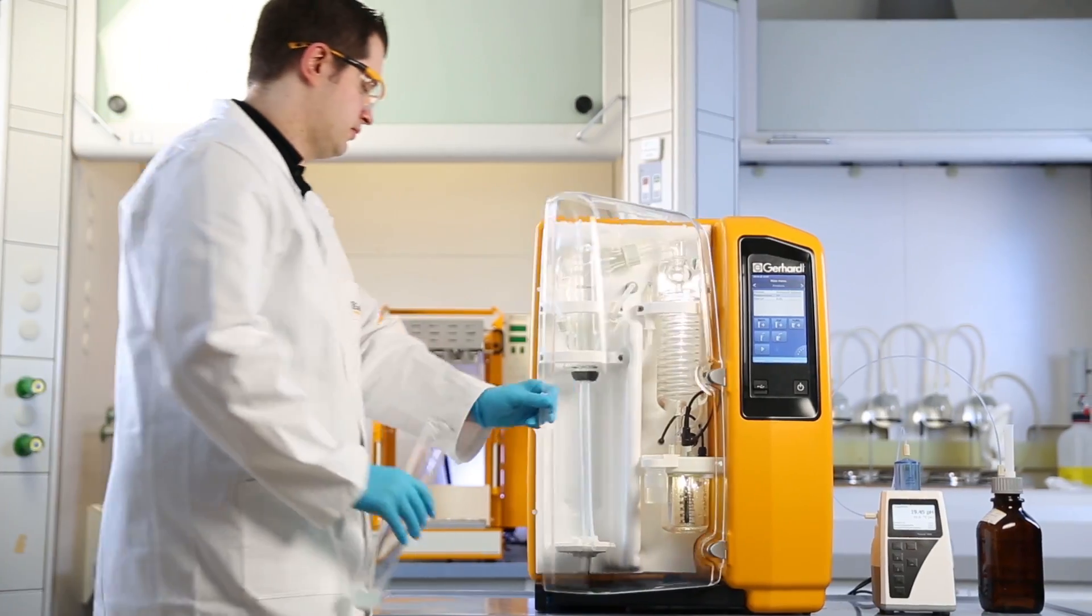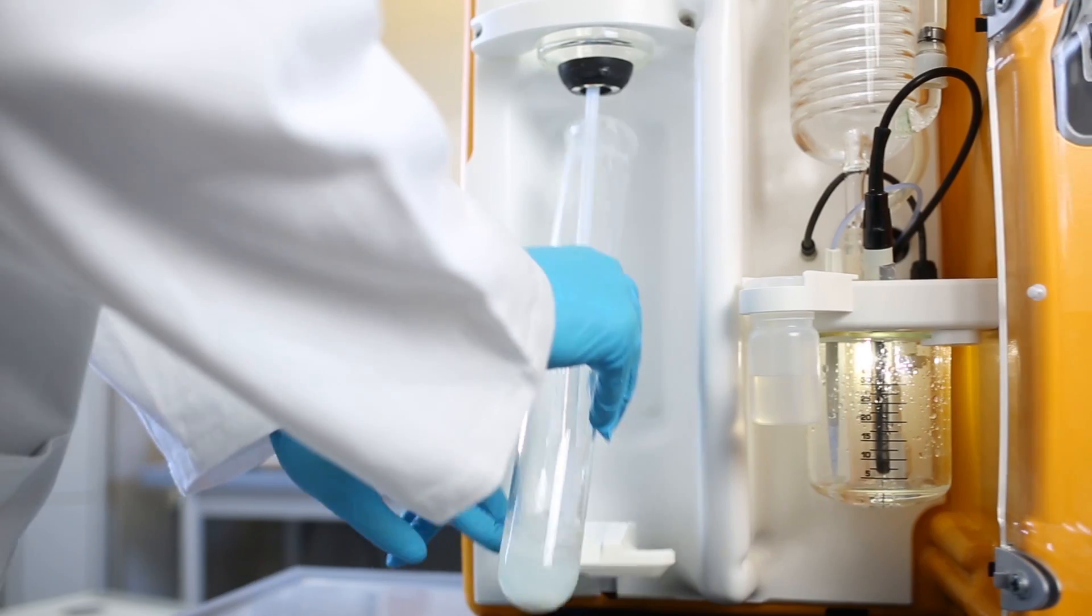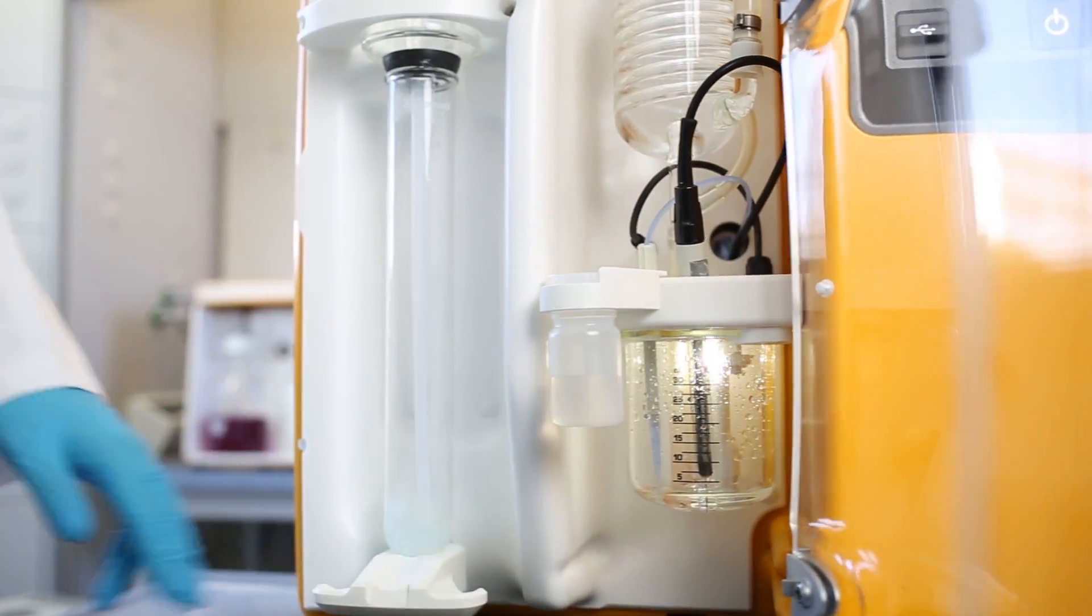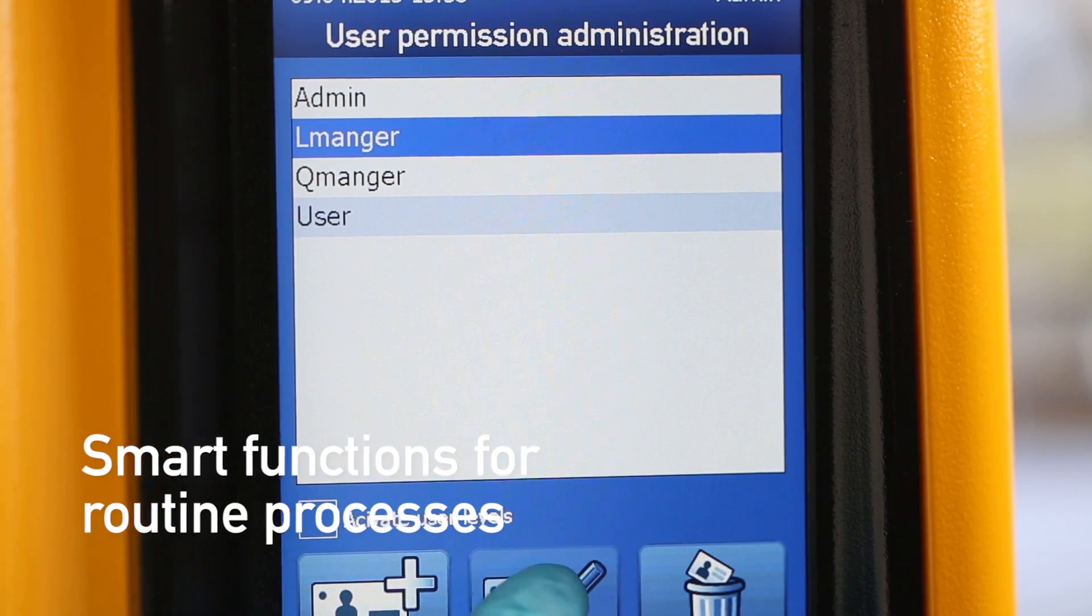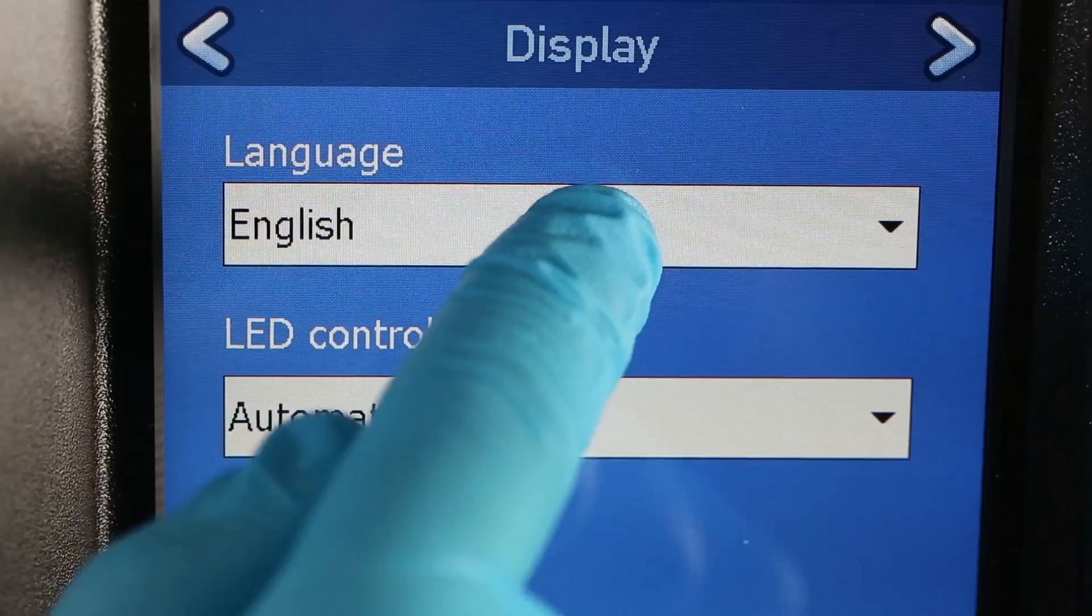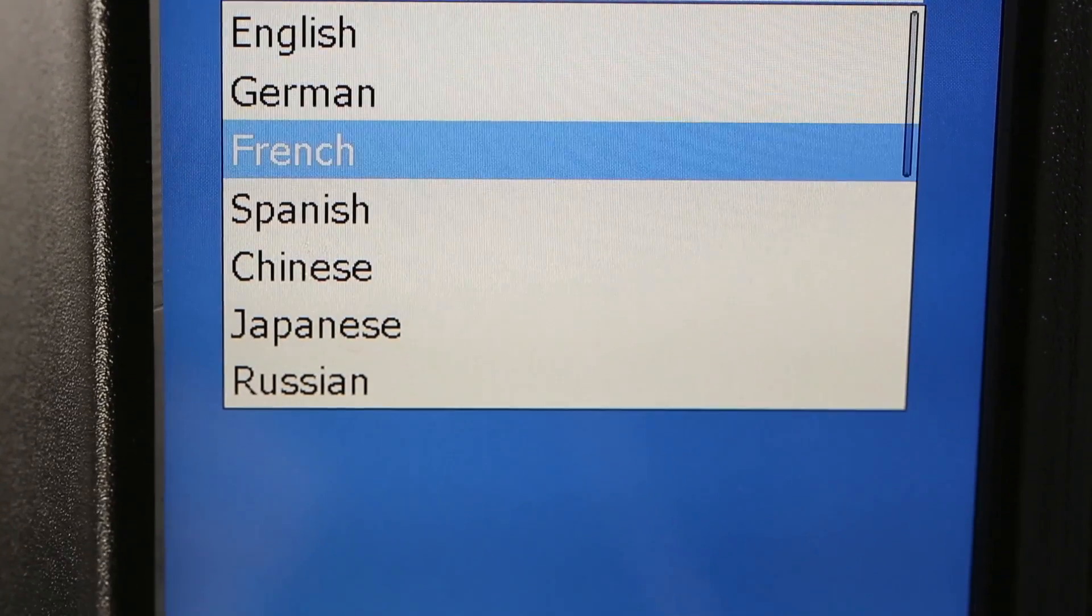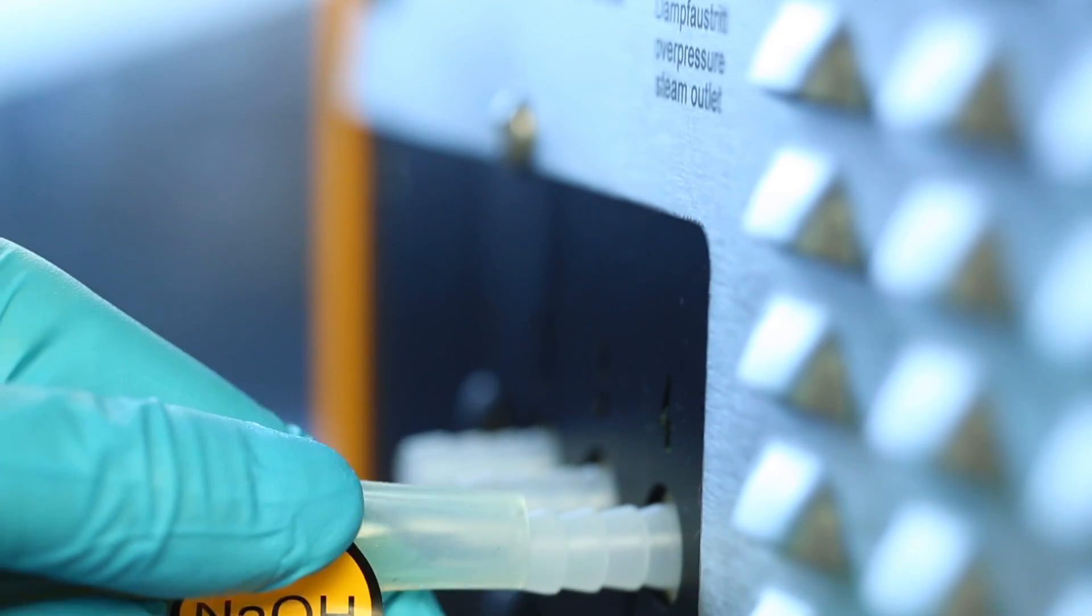The devices are intuitive to use. Simply insert the sample, close the safety door and press the start button. The optional password protection feature and various user levels guarantee that the device is operated only by qualified personnel.